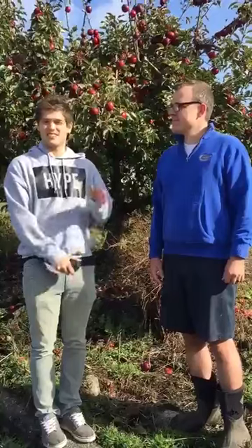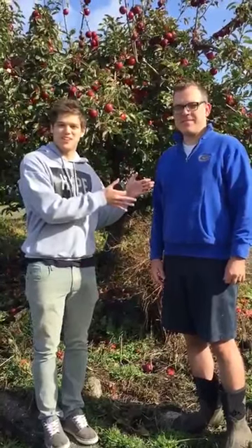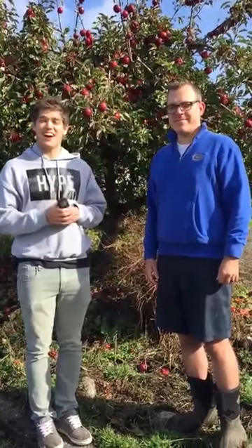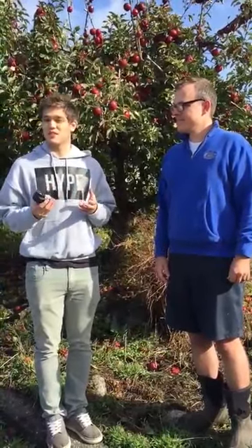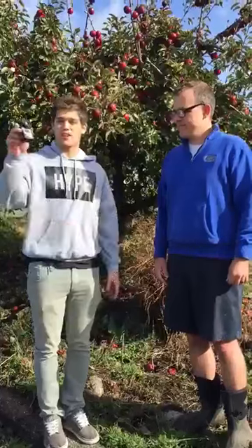Good afternoon. My name is Sean from Otago, USA. This is my good friend Sean Bell. Today I wanted to introduce you to our brand new Apple meter. It's a non-destructive Brix meter called the Paohikari 5.